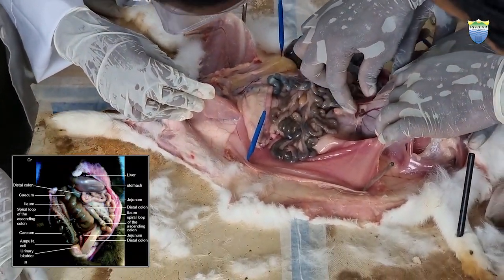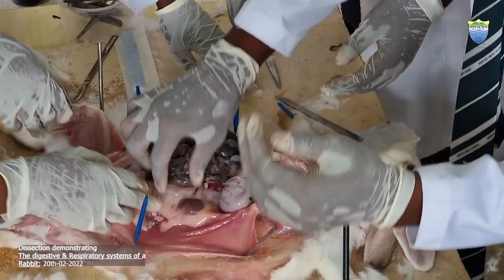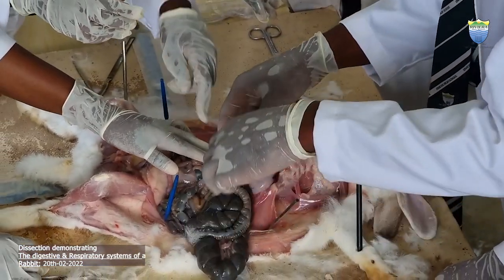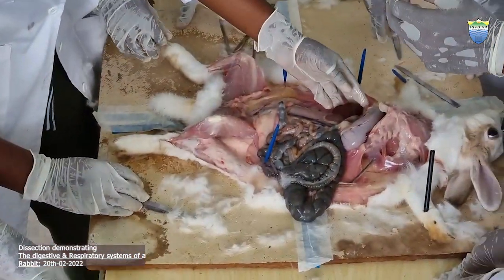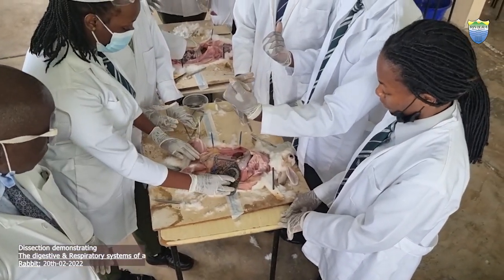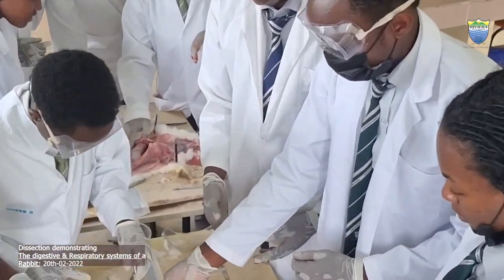So this is also the pancreas. And we also have the kidneys here. This is the left kidney, and now the right kidney on this side. How do you see the positions of the right and left kidneys? The right kidney is located above, and the left kidney is located below. So one is up, one is down. And here we also have the urinary bladder.